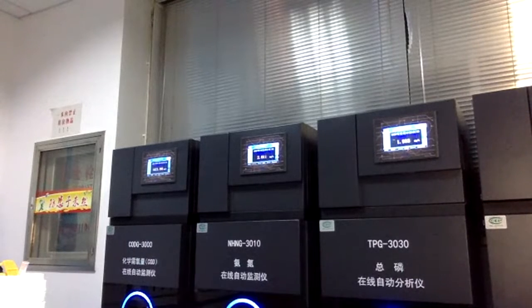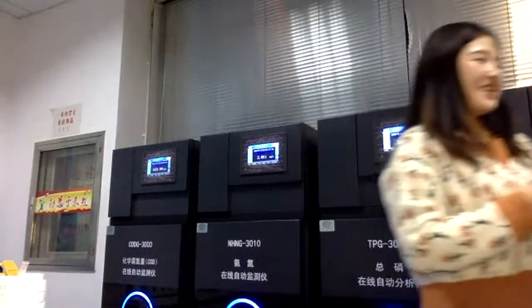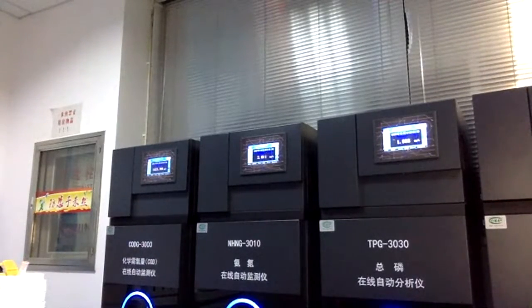So instead of this kind of big online analyzer, we also need to check other parameters for water treatment plants. So I will introduce them to you.